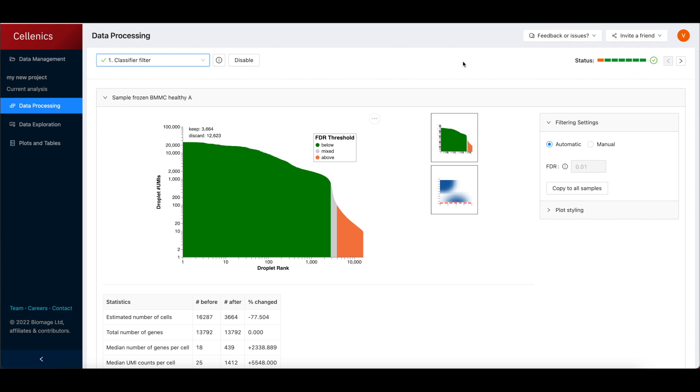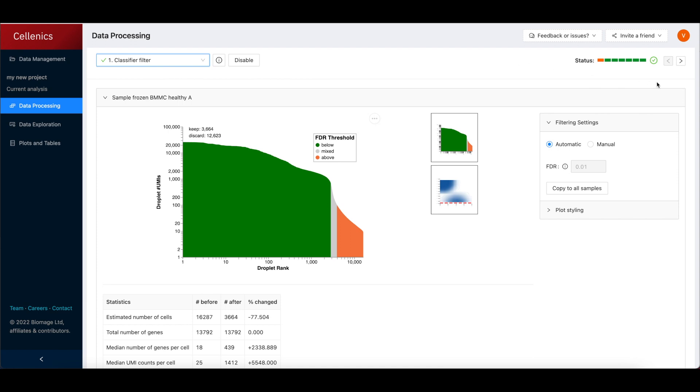The pipeline status indicator shows which steps are currently completed. You can navigate through the seven steps using the Next button or by making a selection from the dropdown menu.